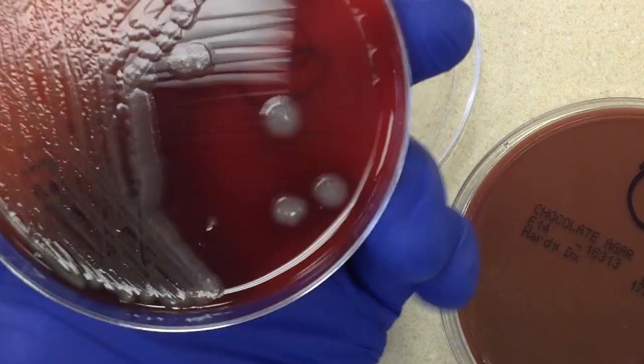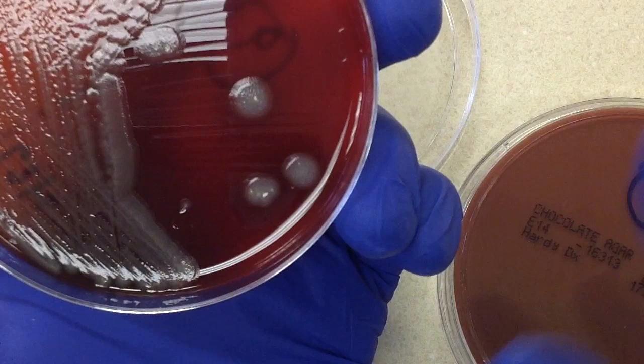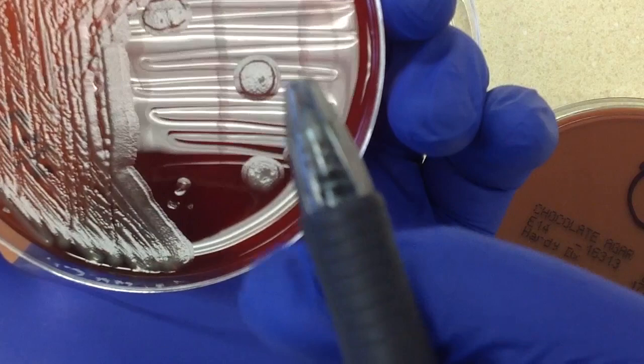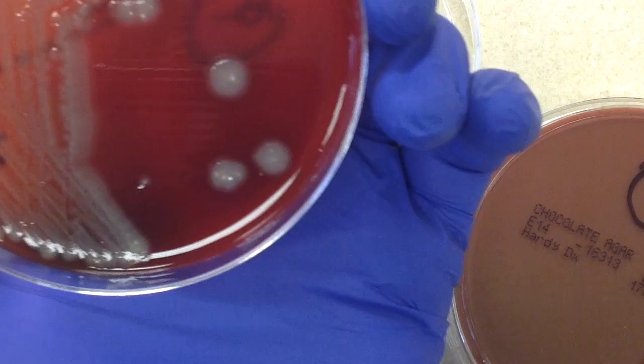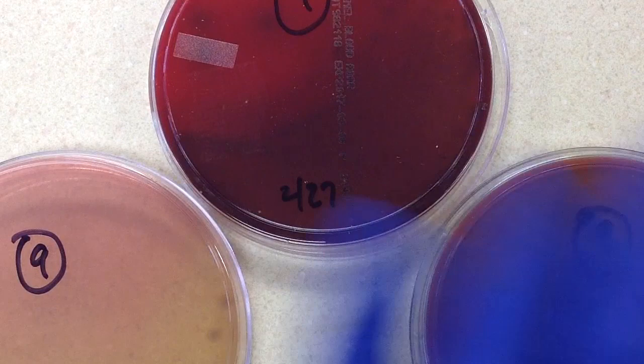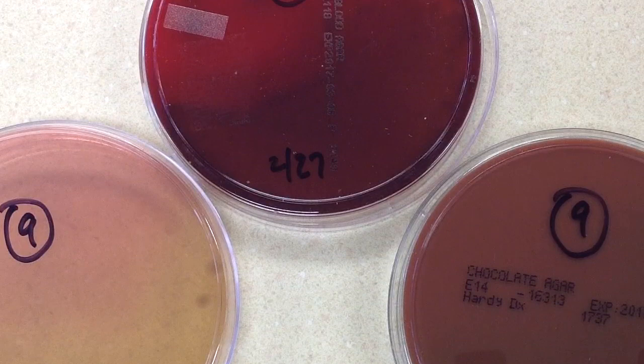Based on experience, I'm guessing these will be oxidase negative. Pseudomonas aeruginosa would be flatter, have more of a sheen, and a characteristic sweet smell. What I see here is a slight swarming feature — an inner colony zone and then an outer one. Assuming oxidase negative, that places it in Enterobacteriaceae. Even if it were oxidase positive, it would basically get the same workup: we'll put this on an instrument for identification and susceptibility testing.